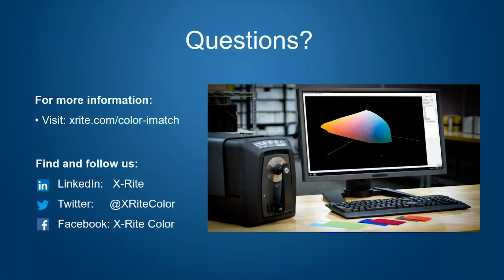But if it's some type of effect plastic that may be able to be characterized by a specular included, specular excluded measurement, then again, we have not had a lot of customers who've done that just yet. But our expectation is that with version 10 we would have some control over those types of effects that can be characterized that way with the new engine.